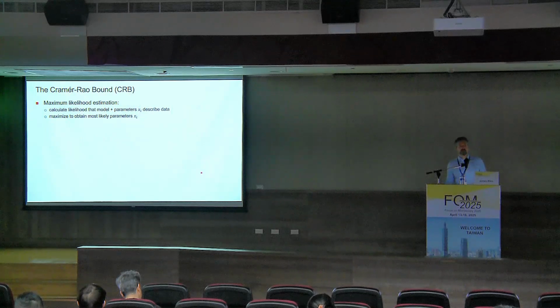So this is very simple, but often the world is more complicated. There are more confounding factors we want to take into account. And then we can calculate more accurate estimations for the localization precision using Fisher information theory, the Cramer-Rao bound. I don't want to present you the equations here. It's something that you can look up and that is really useful to do. I just want to give you an idea how this works.